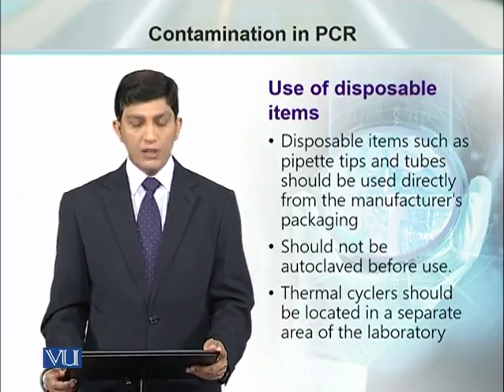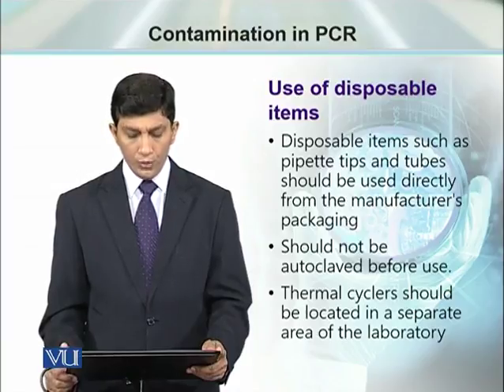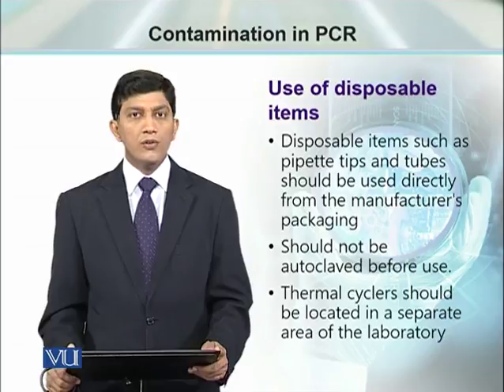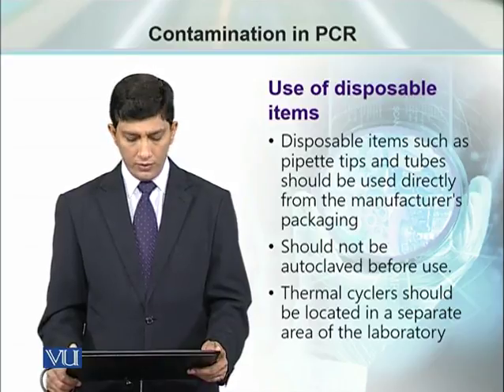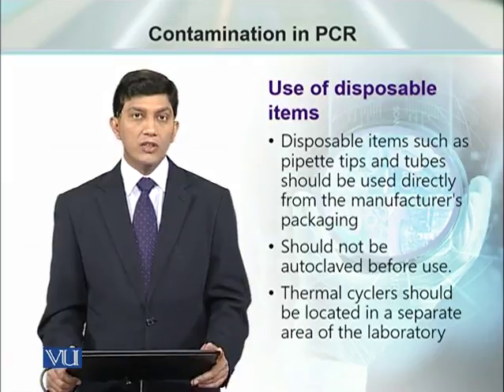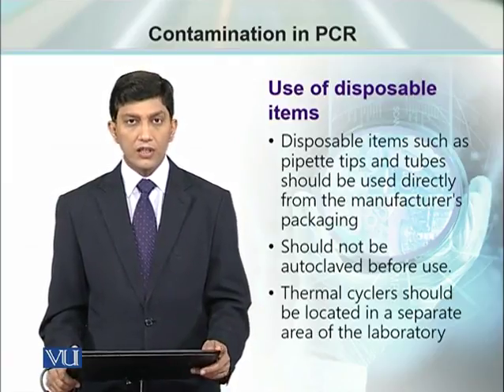Always use disposable materials like pipette tips or tubes directly from the supplier's packaging. Don't try to autoclave them, because autoclaving may be a source of contamination. The thermal cyclers, the machines in which PCR has to be run, should be placed in a separate area of the lab.